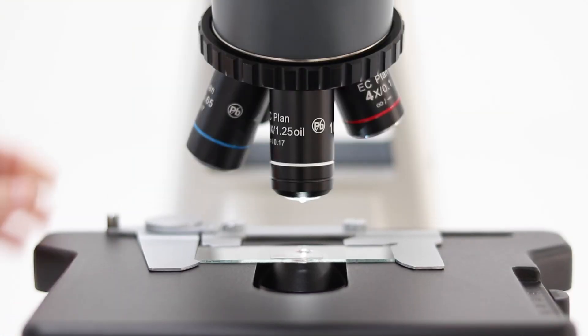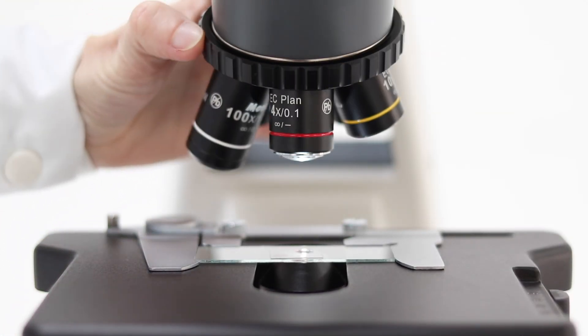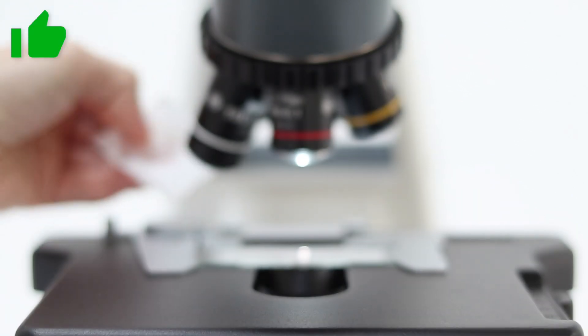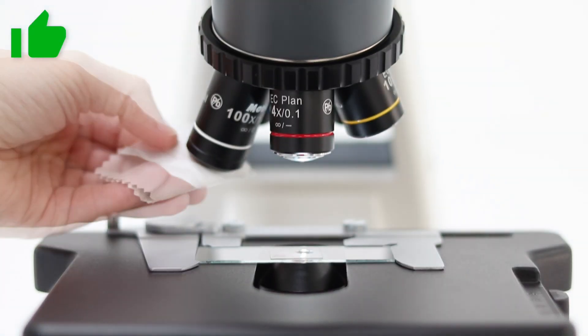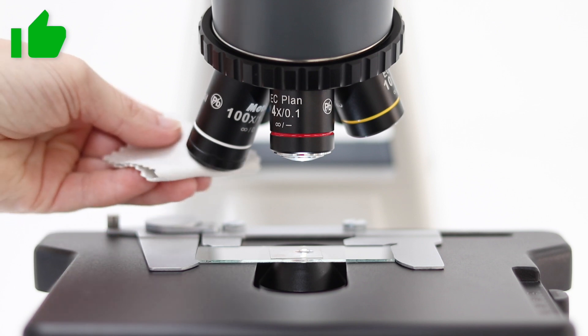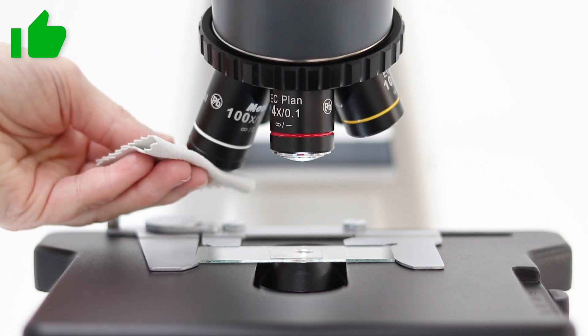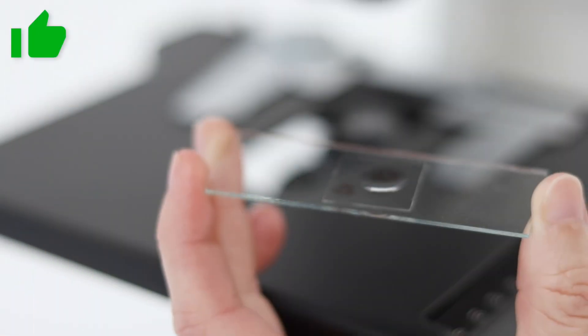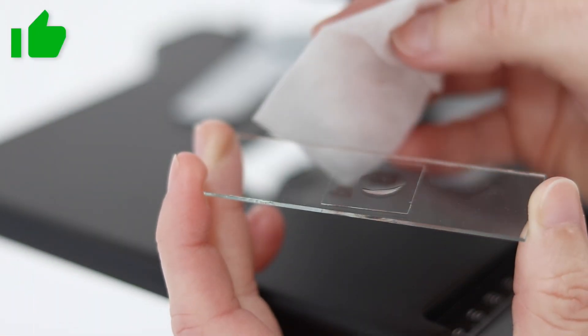Once your sample investigation is finished, the oil should be wiped off the objective using a lens cleaning tissue. Any residues should also be removed with a soft cloth moistened with petroleum benzene or absolute alcohol. The same procedure should be repeated on the specimen slide.